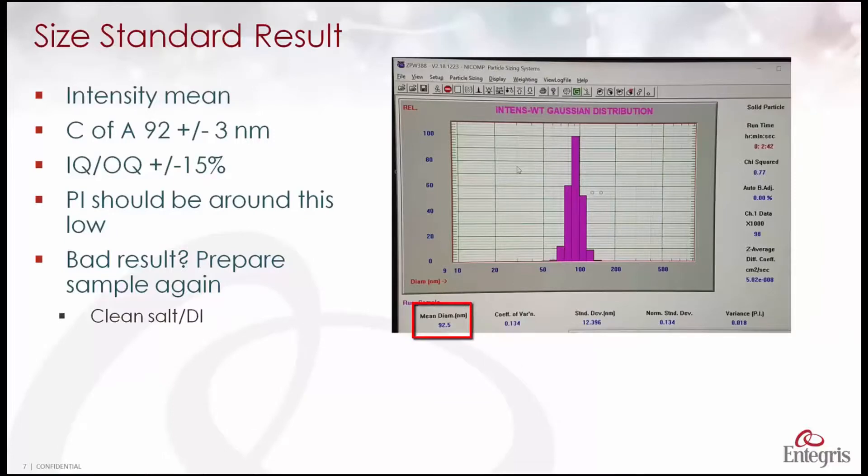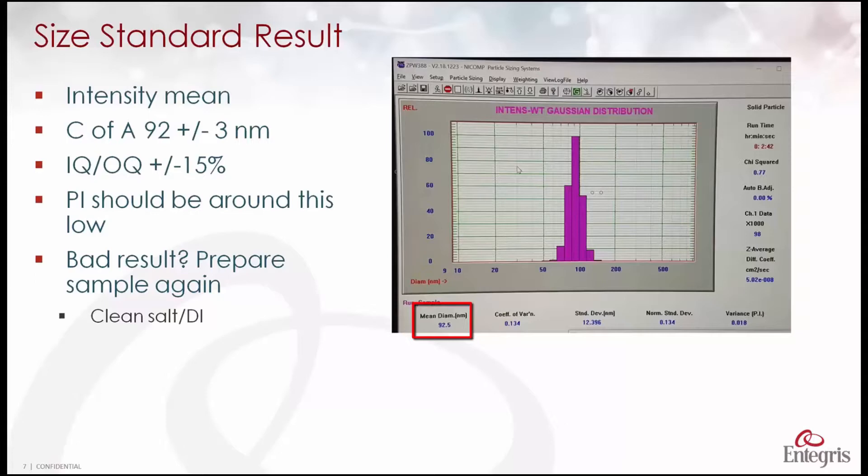Here is the result of the measurement we just made of the 92 nanometer polystyrene latex standard. The number we focus on is here, the intensity mean diameter. The certificate of analysis for this standard is 92 plus or minus three nanometers. We see we got a perfect result there.